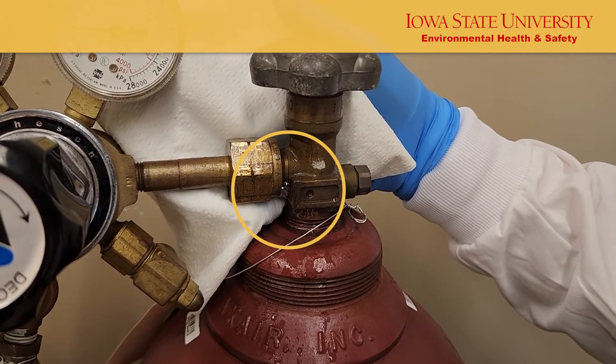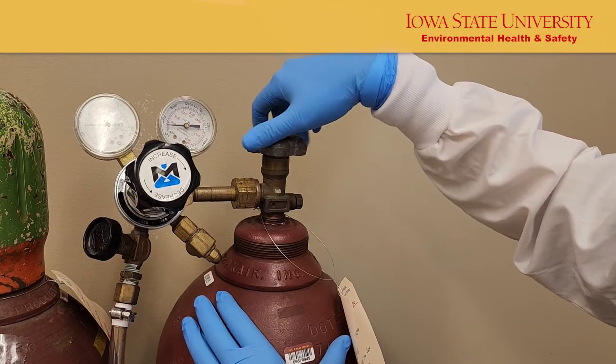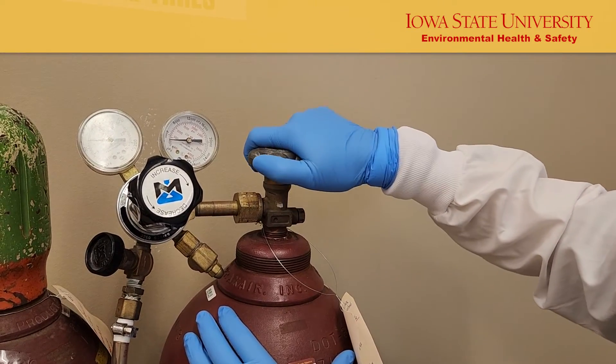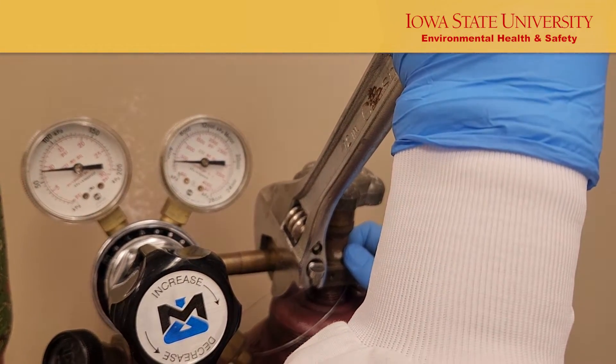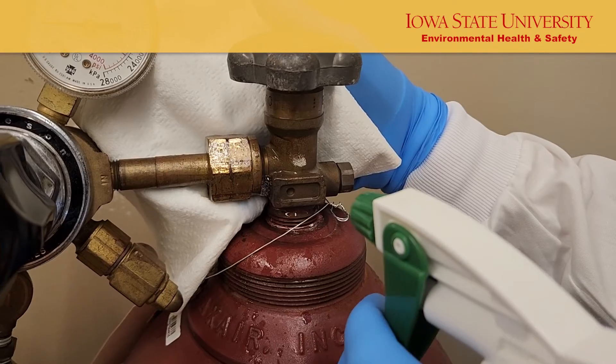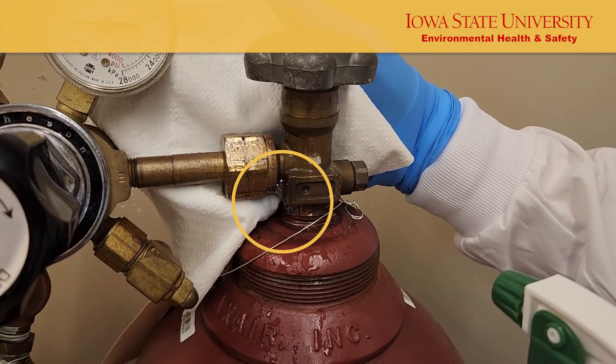If there is a leak, close the main tank valve to ensure there is no further leak, then tighten the connection again with a wrench. If the leak remains after the nut is fully tightened, the regulator may need to be replaced.